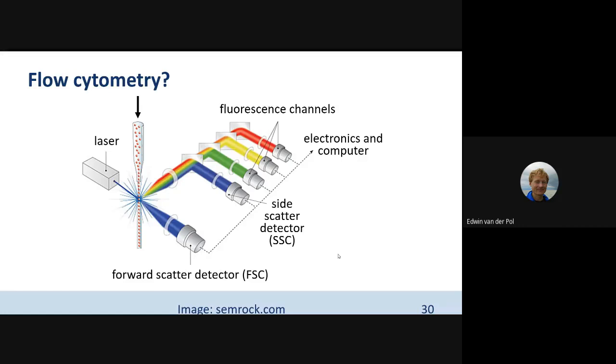10,000 is very typical indeed. 10,000 particles per second. We measure in the lab vesicles at a little lower speed of throughput. We measure vesicles typically at 5,000 particles per second because they are so small. So we need to reduce the speed a little bit to collect more photons. But cells you can readily measure at 10,000 particles per second. Even 100,000 cells per second is feasible.